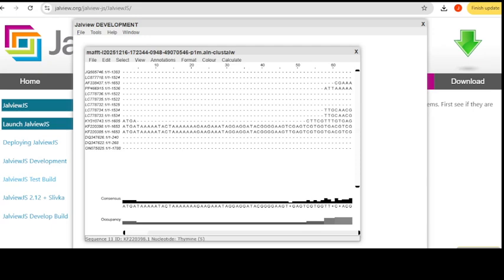But if you look at these ones, see the TAAT, these are pretty similar. If you look at these, the box that I'm making around it is a pretty similar sequence. Even here, some differences are starting. So here, this T is different than this G, than this G. But this is what you need for phylogenetic tree analysis, okay?